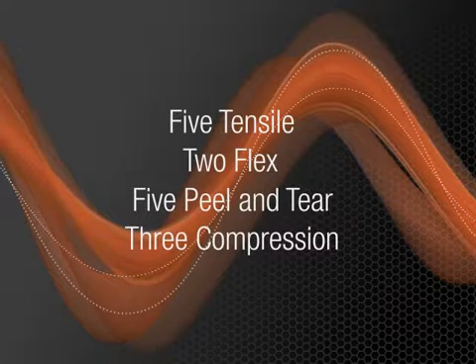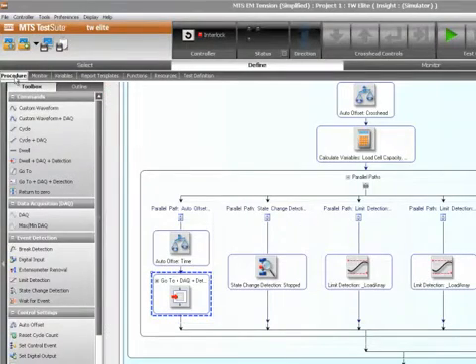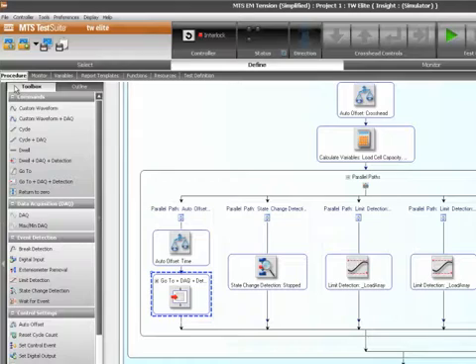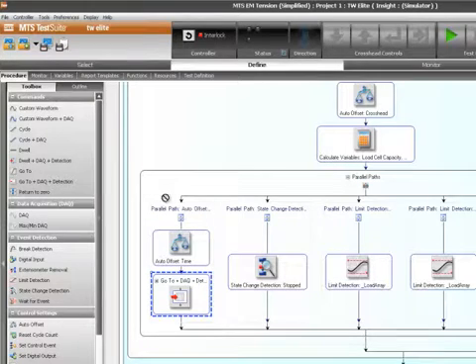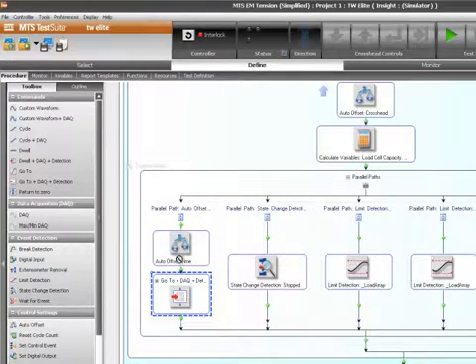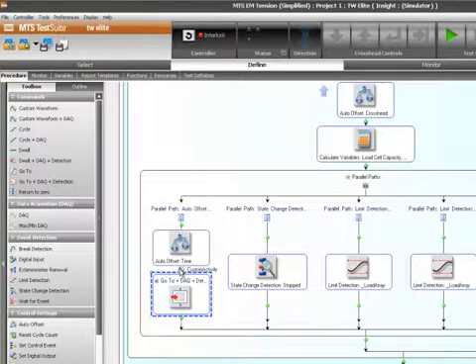All base templates can be used for simple tests and easily modified to accommodate specific test procedures. For more sophisticated testing, we offer hundreds of pre-packaged, standards-compliant advanced templates, which are also modifiable to meet your requirements.